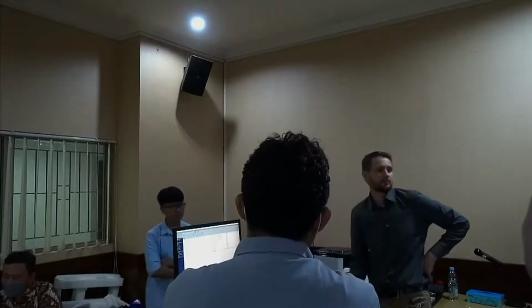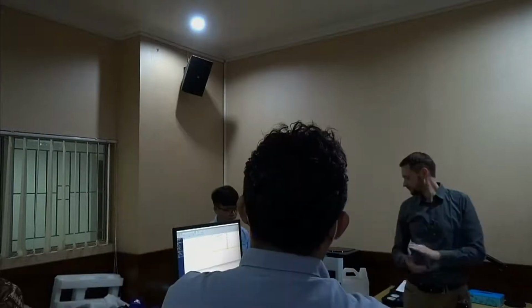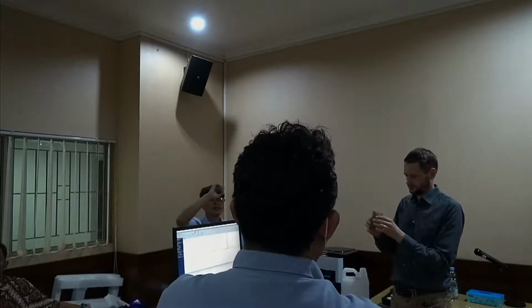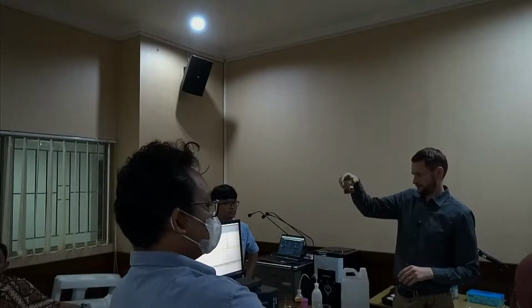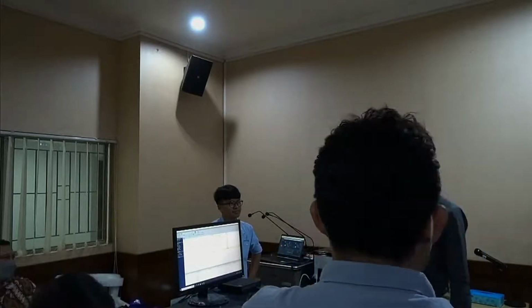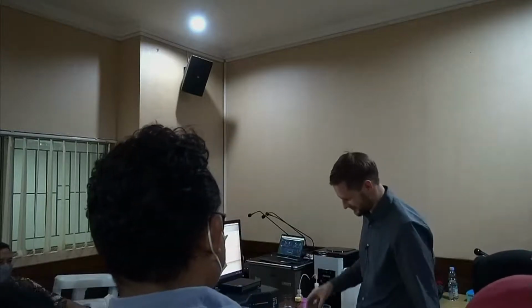Okay. Maybe I would ask the people who had samples with them. Mbak, sampel yang tadi Mbak, yang nano solution. This looks familiar, but I had similar stuff from mining companies, so I'm very glad it's your instrument now, because this is stuff where you really need good cleaning afterwards.